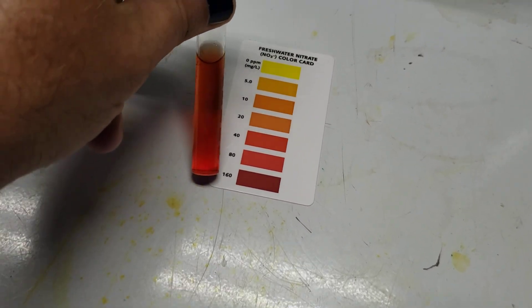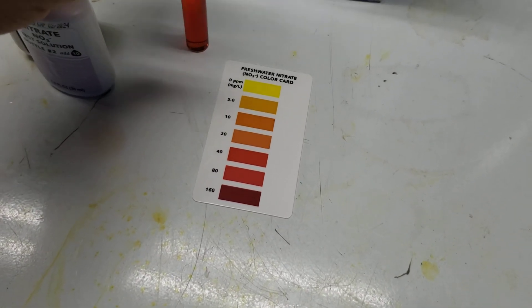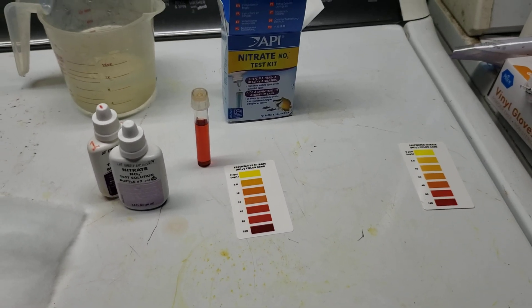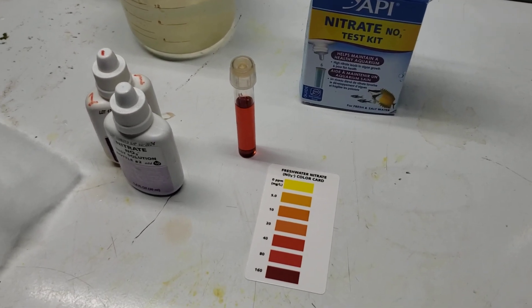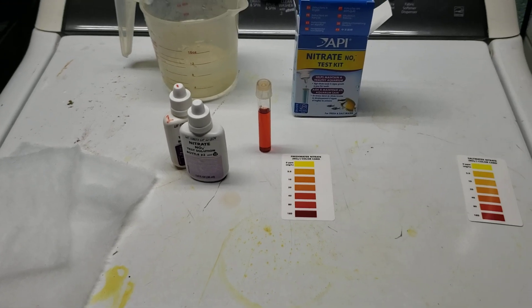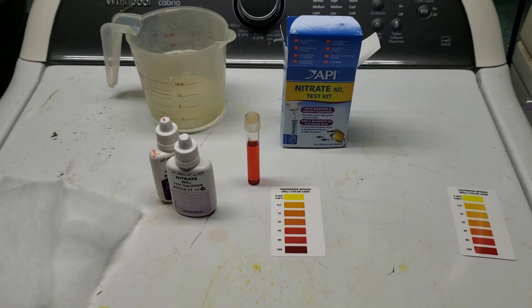They're meant to give you a general idea of what's going on in your tank. In this case, I've got the general idea that we're about 30 to 40-ish parts per million, somewhere in that neighborhood. But again, that's just an arbitrary number — there's no magical transition that happens with the nitrates where they suddenly become dangerous beyond that threshold. We'll talk more about nitrates in another video. It's one of those videos I just really don't feel like shooting, but I will one of these days.